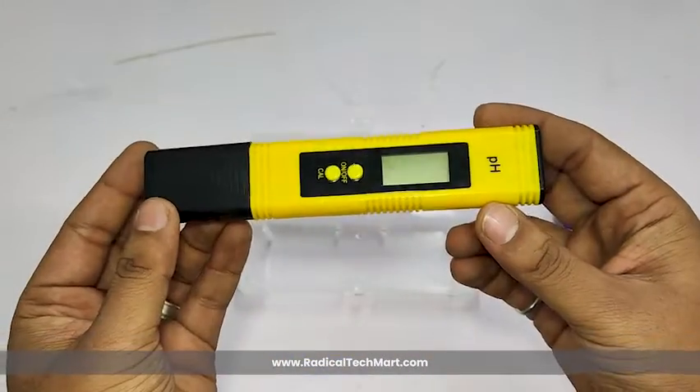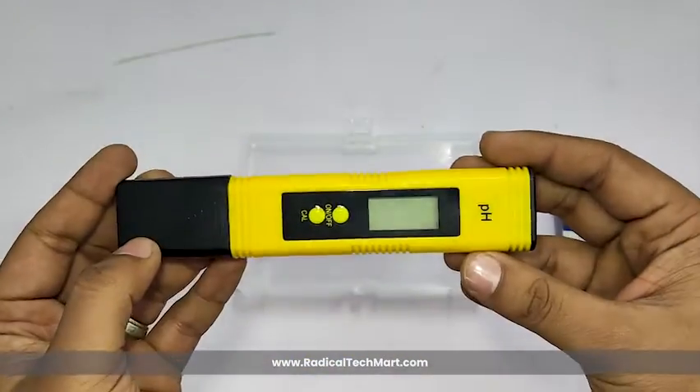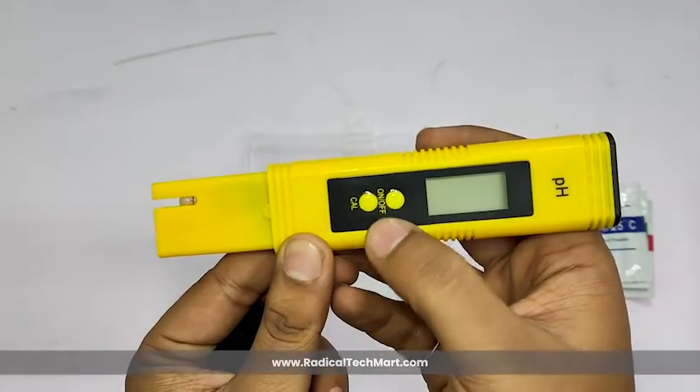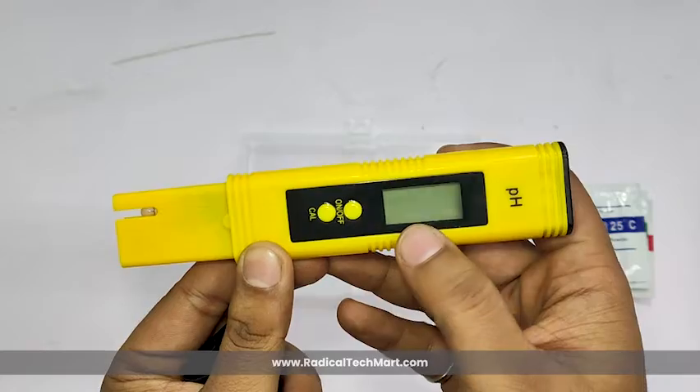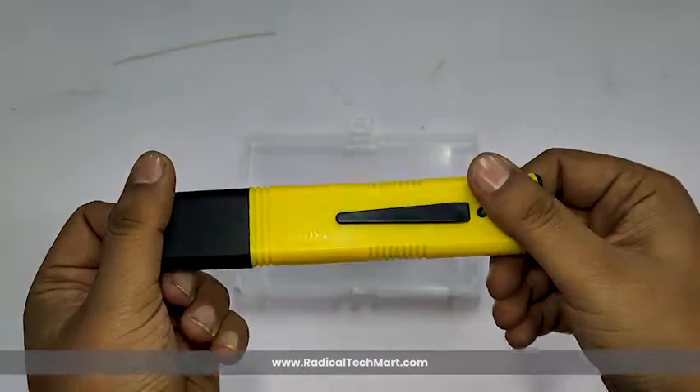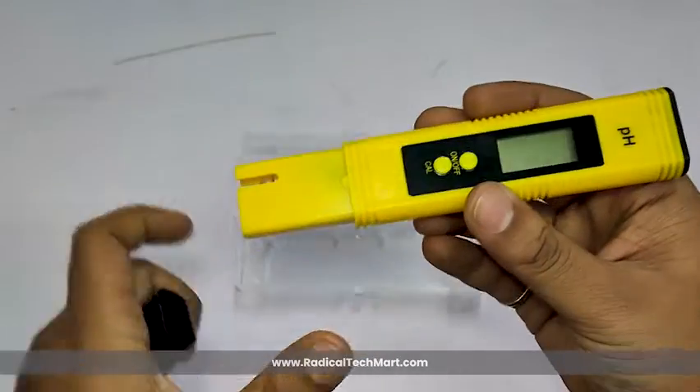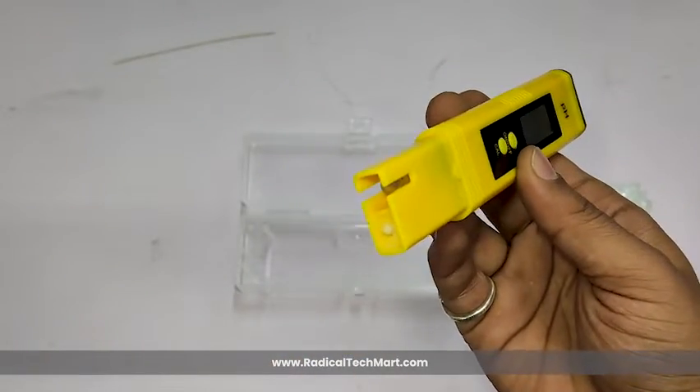At first glance, the meter looks nice and sturdy. The device has two buttons along with a display on the front side — one button is for on/off purpose and the second is for calibration. The meter features a sleek, pen-like design. Removing the protective cap reveals the electrode, designed for accurate measurements.